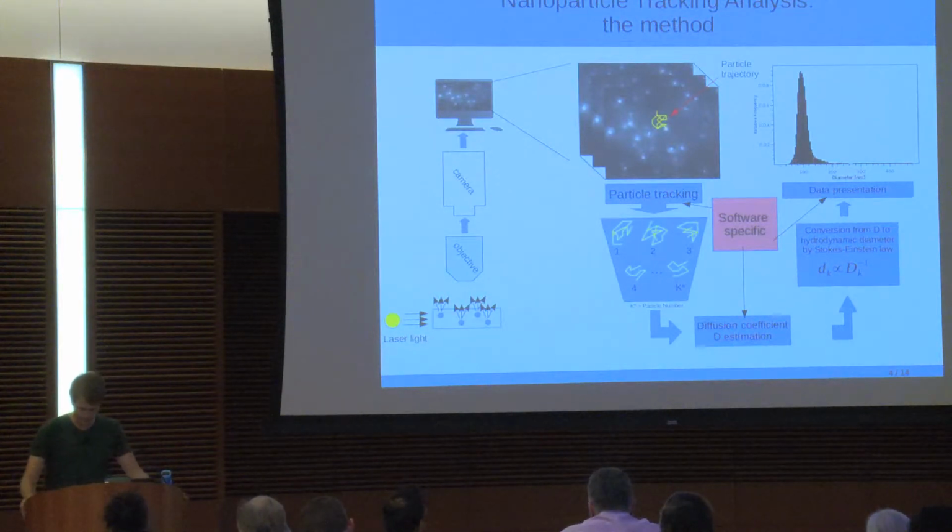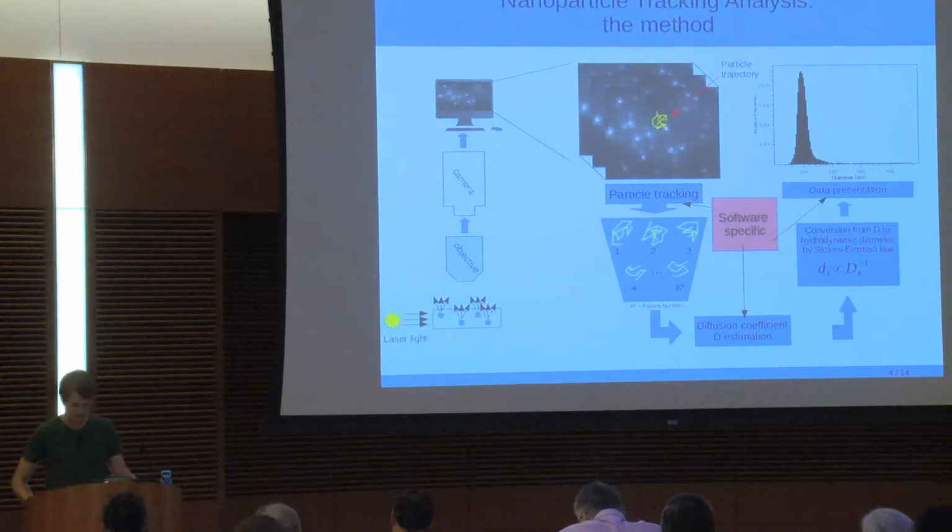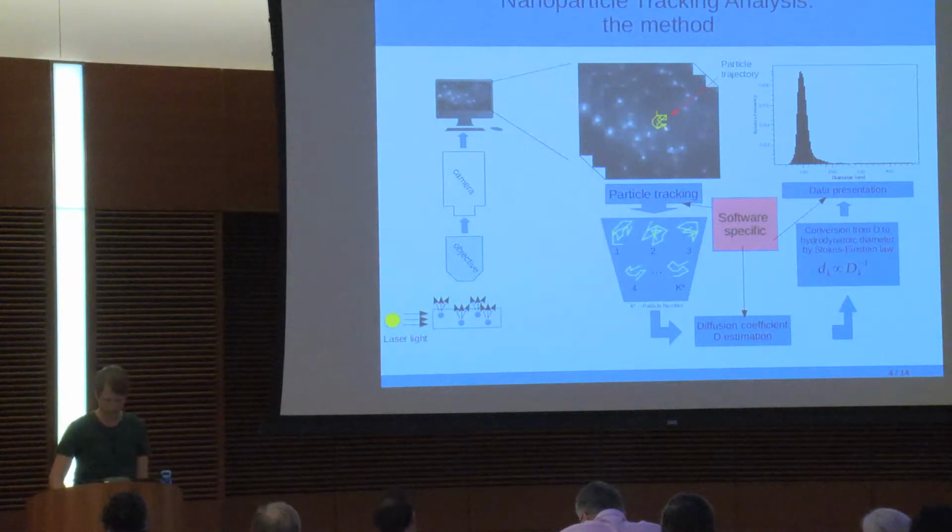I want to highlight that many central elements of the NTA technique rely heavily on the computer program used. For our experiments, we want to have all these things under our control, and therefore we developed our own analysis software, which I'm presenting here at the moment.